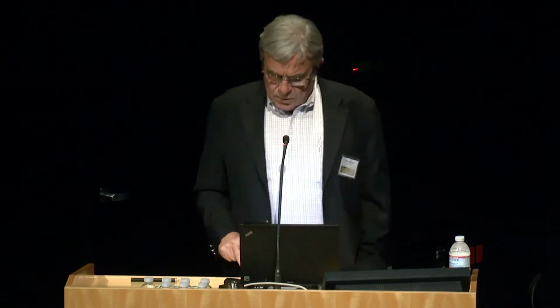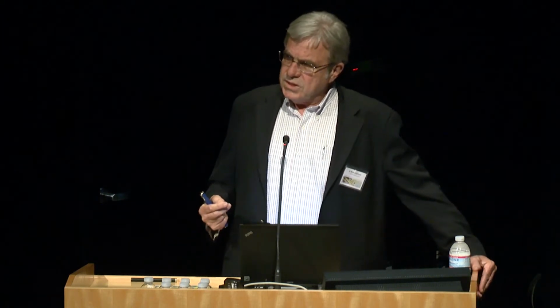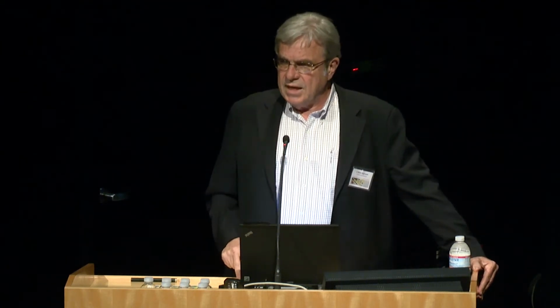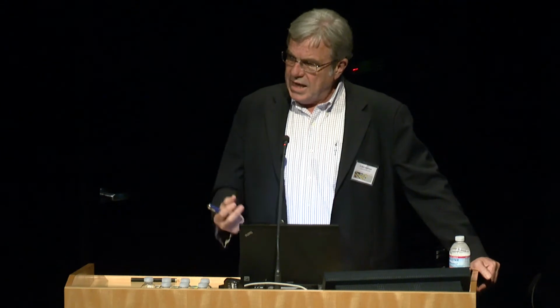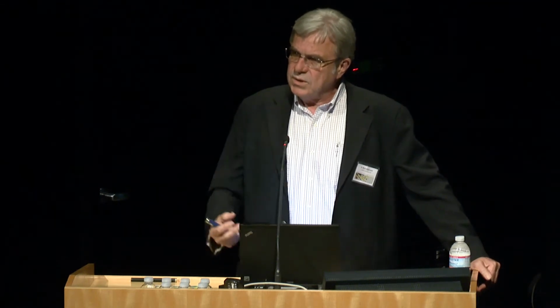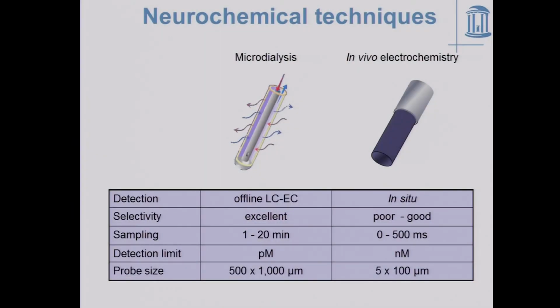And as I've said, the dimensions are quite small, not small enough so that we're in a synapse. We're certainly sampling in the extracellular fluid, but it turns out that dopamine isn't restricted to synaptic communication. It does what's called volume neurotransmission. That is, it interacts with receptors, transporters, and so on, outside the synapse.